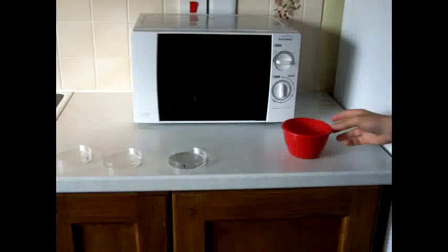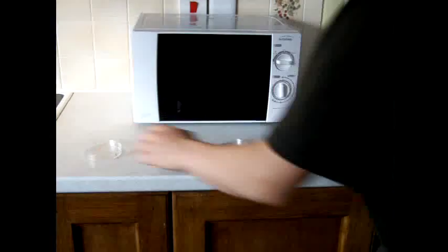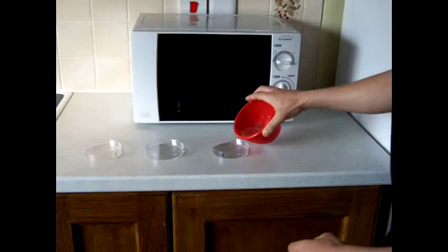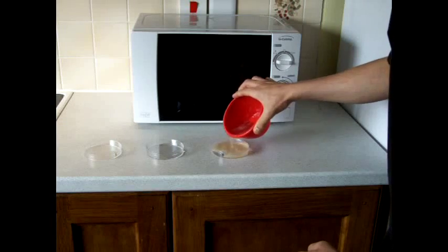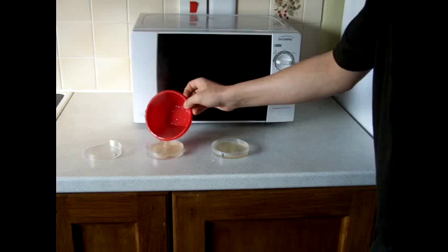Once it's frothed for the third time, you can pour it into the petri dishes. This is quite hot, so be careful.